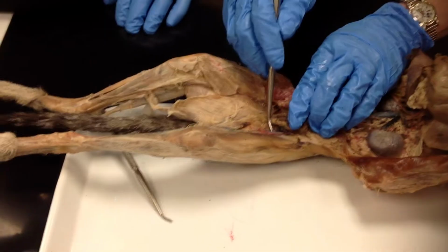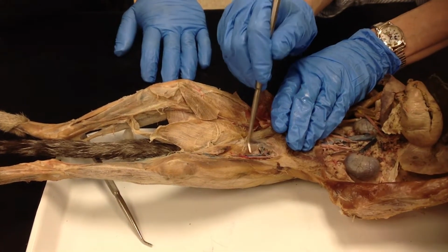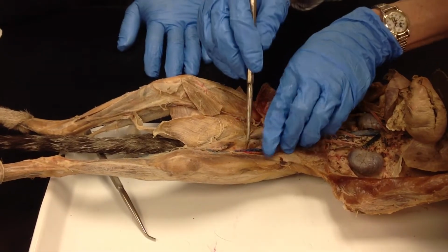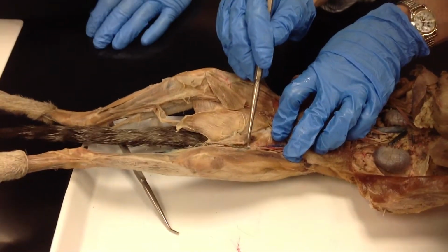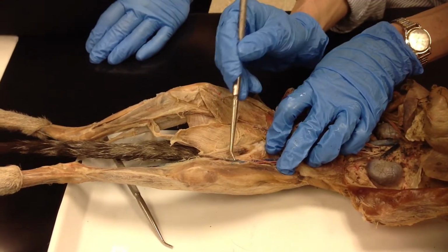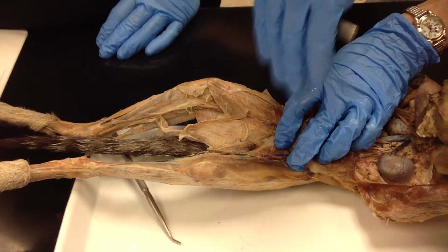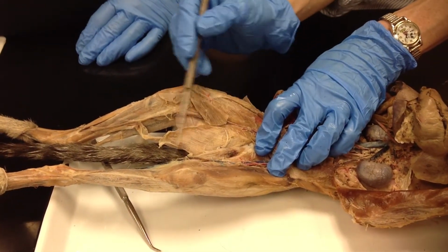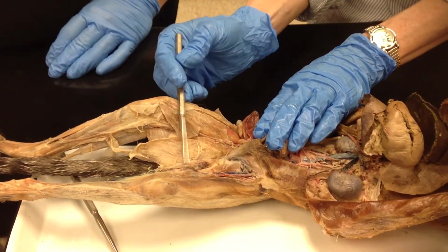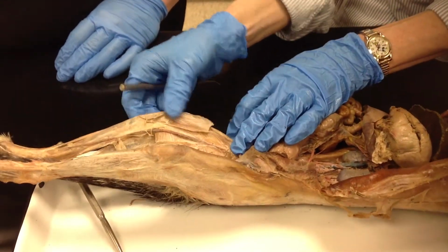And then once we get into the thigh, again, this is our femoral triangle here, remember, from our muscles? When we had muscles here to identify. So now when we're in the thigh, we're femoral. And then there should be a little branch out here that's also deep femoral. Which may be this one right here. I'm not sure. I can't even get it. It's too crunchy. Anyway, deep femoral goes down deep this way. And then this runs down the rest of the femoral, because the femoral is fairly superficial. Okay. And on the right side, you have the saphenous vein, which is a major branch.